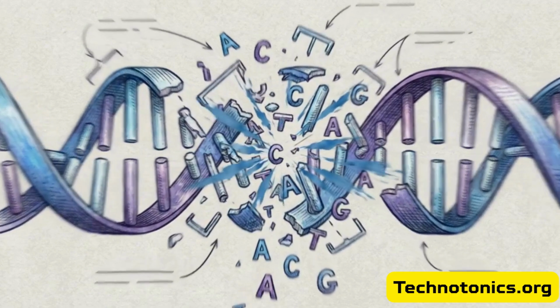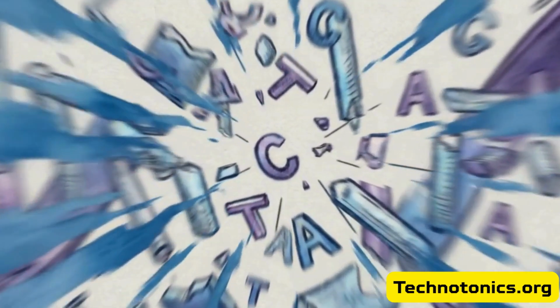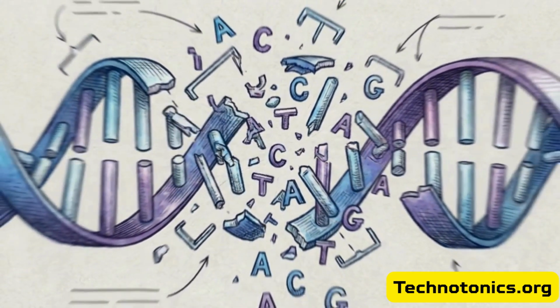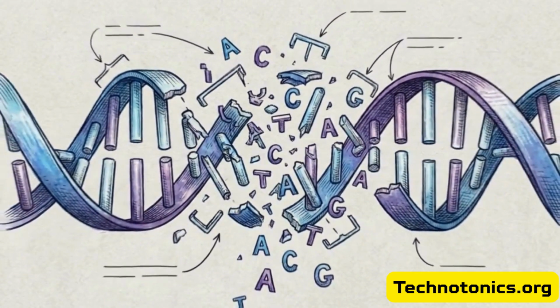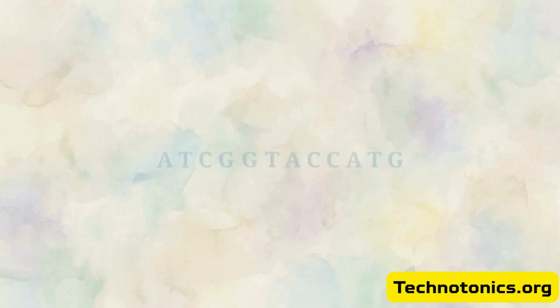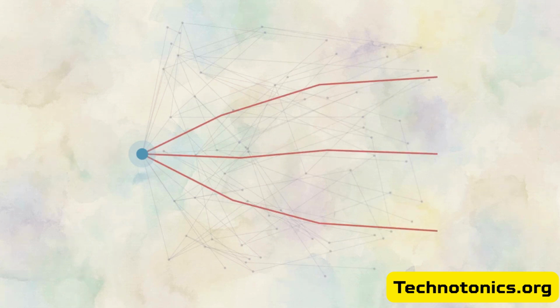You are looking at a string of raw genetic code. Isolated, it is completely meaningless, just a scattered collection of biochemical letters without context. In this video, we will take that raw sequence, format it correctly, run it through the National Center for Biotechnology Information Database, and pinpoint exactly what organism or function it belongs to.